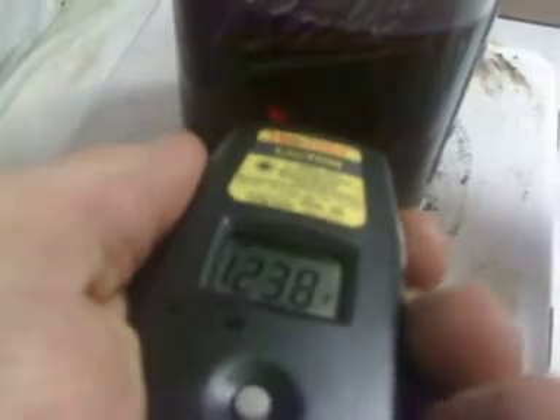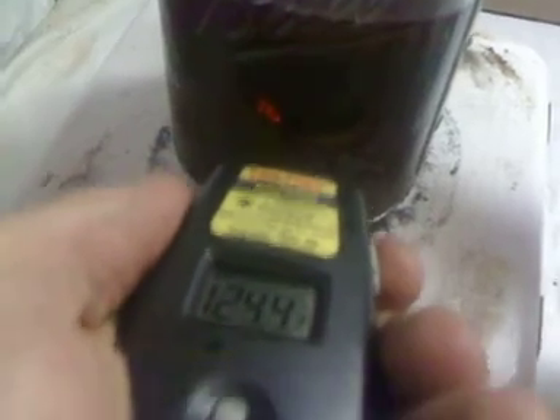Going to check the temperature again. It seems to be stable at about 123 to 125 degrees.